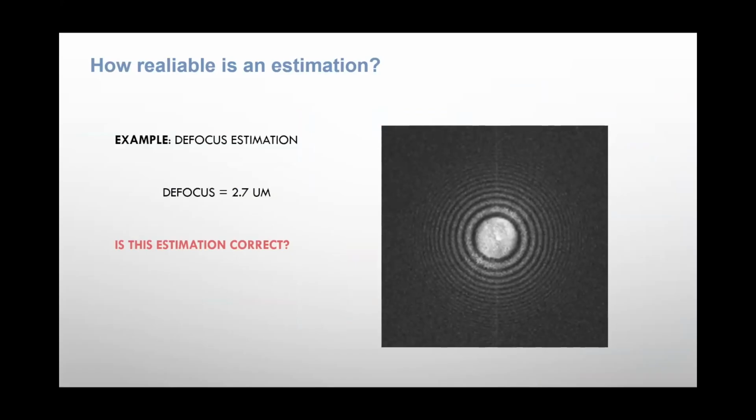So this question is obvious. I chose a specific question and a specific software, but now the question is: I got a result, and can I trust this result? Is the estimation that I carried out correct? For instance, this is an example. This is a real example.